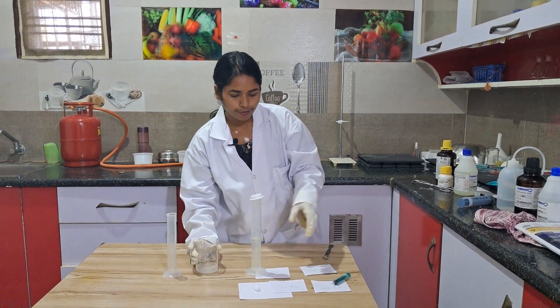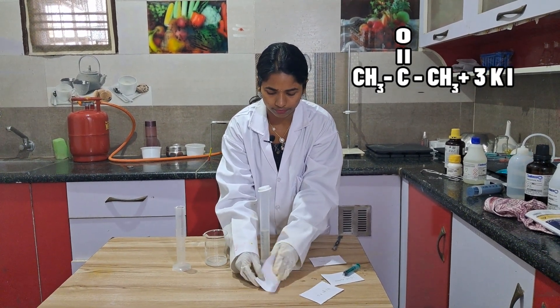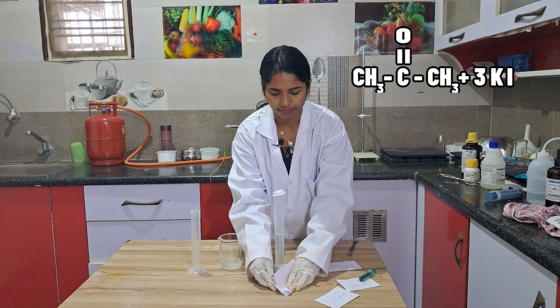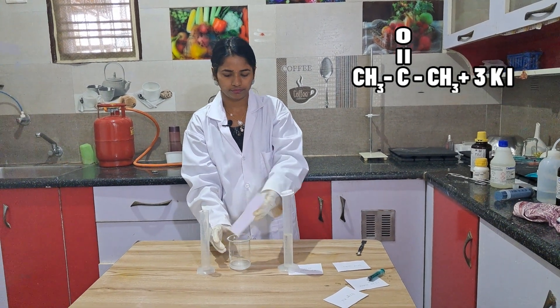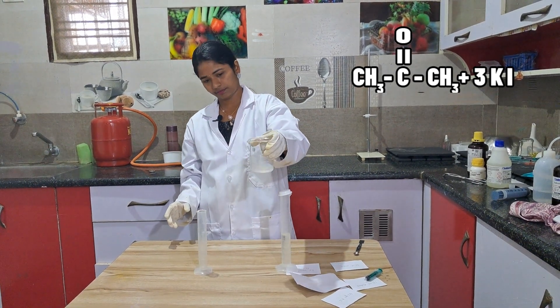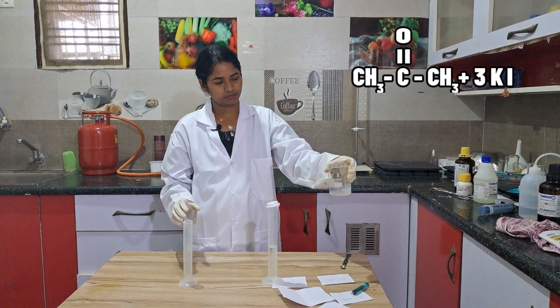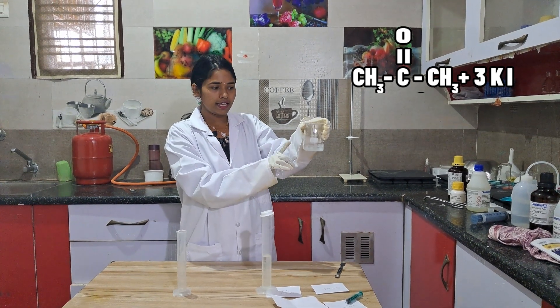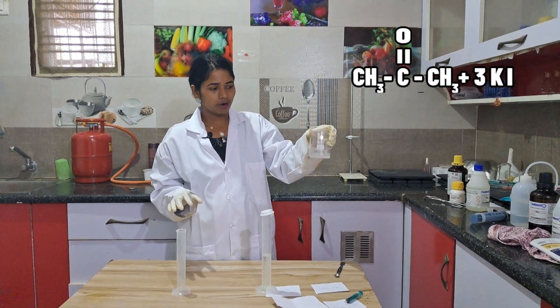In this, add 4.2 grams of potassium iodide which I weighed and kept here. I am pressing it so that we get the powder — dissolution will be faster. Now dissolve it. We got a clear solution. So this is acetone dissolved in water, to which we added potassium iodide.